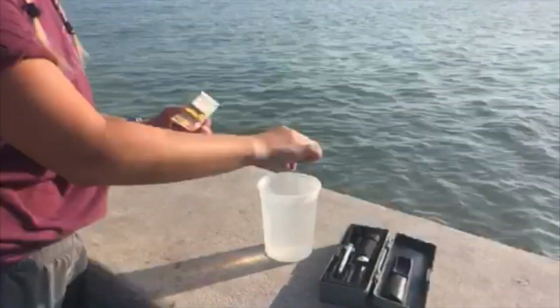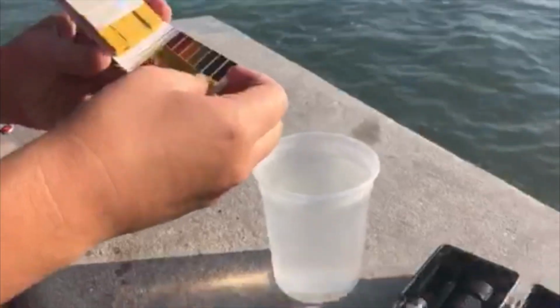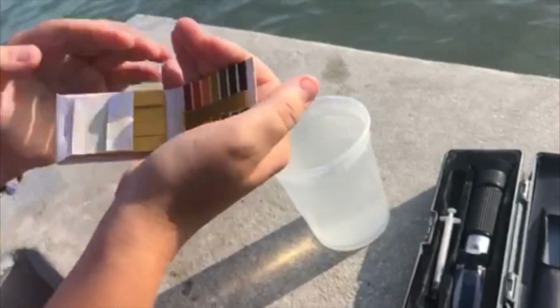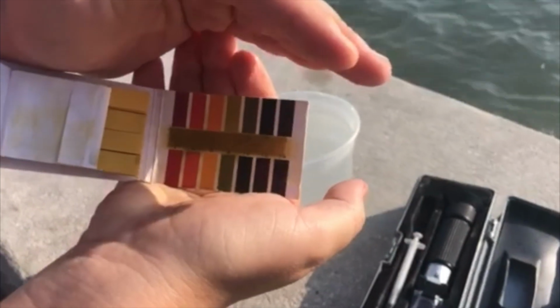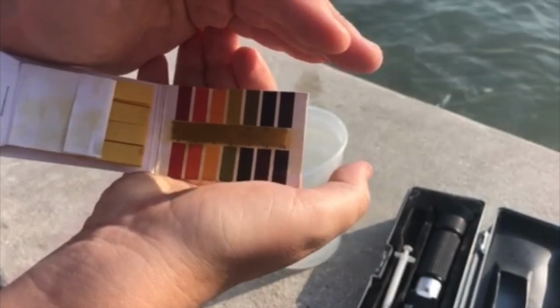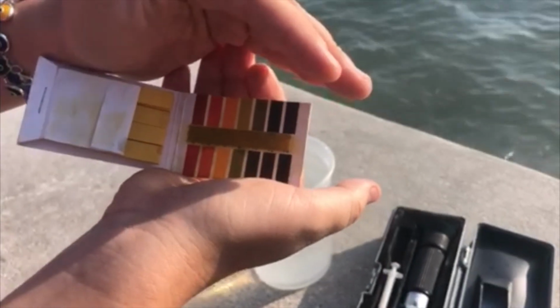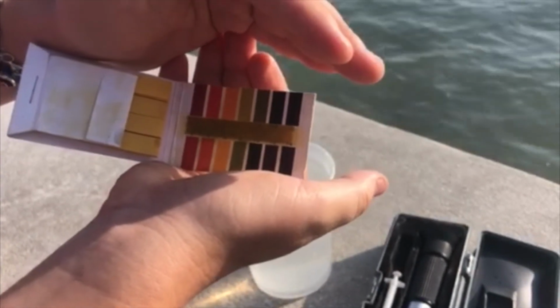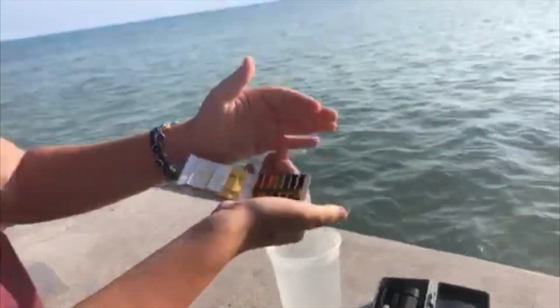So what we're going to do is stick your strip into your sample. You're going to lay it out on our color scale. Hopefully you guys are able to see that. And as you can see, it's changing color to determine what the pH is. And I think actually it's about a dark green color, which is right where that 8 is. So hopefully you guys can see that. But yeah, it's a little bit darker, so that's really good. That means that our ocean probably has a really good pH.